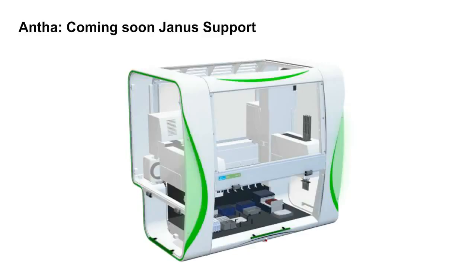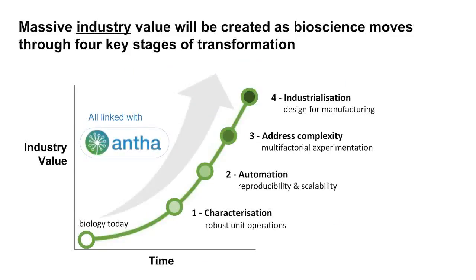And as I mentioned, the nice thing about having written it this way is that it will translate from extremely capable instruments that can run complex integrated processes on themselves, such as the Janus, all the way through to simple actions like a Gilson pipette max or even manual workflows. So where do we see are the changes that have to be made in how we work with biology?